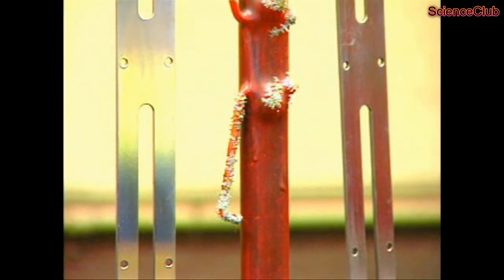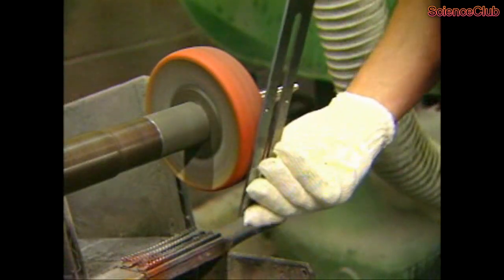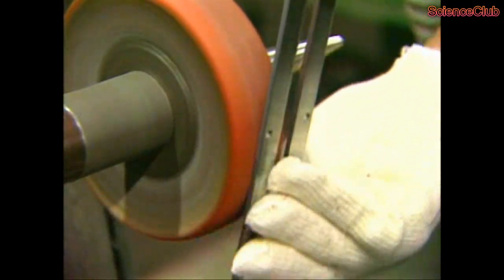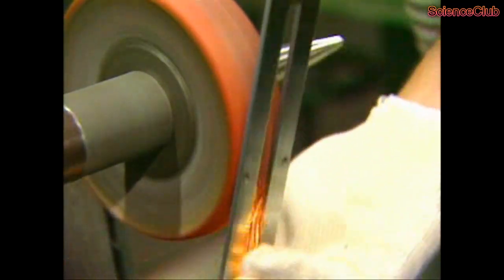The preparation of the base metal is essential for quality plating. The base metal must first be cleaned to remove both grease and oxidation. Often the metal is then chemically etched to improve adhesion of chromium ions.